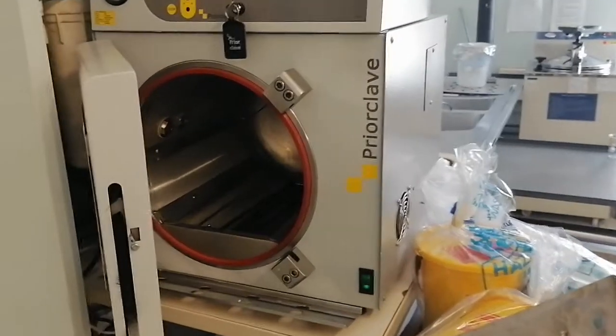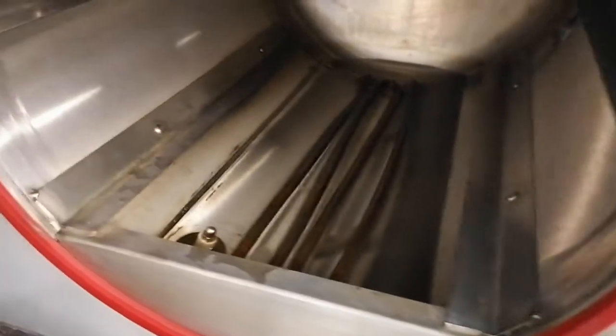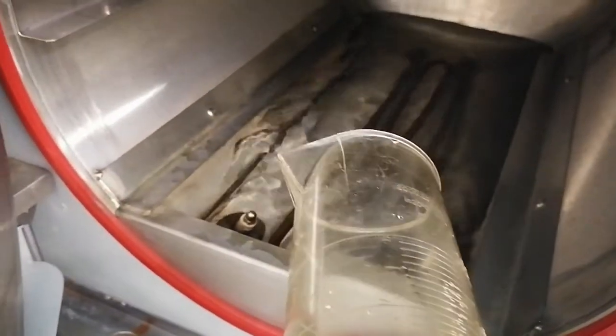How to operate the prior clave to autoclave waste? Well, it's just like a kettle. So first you want to see that the element is covered with water. And then we add some water. So it takes about 2 liters of water.